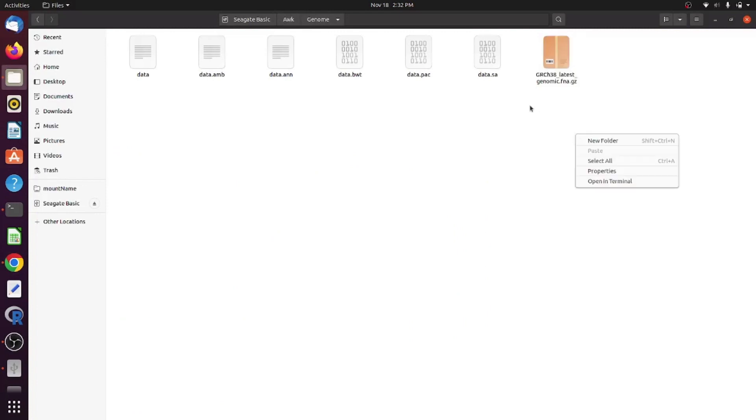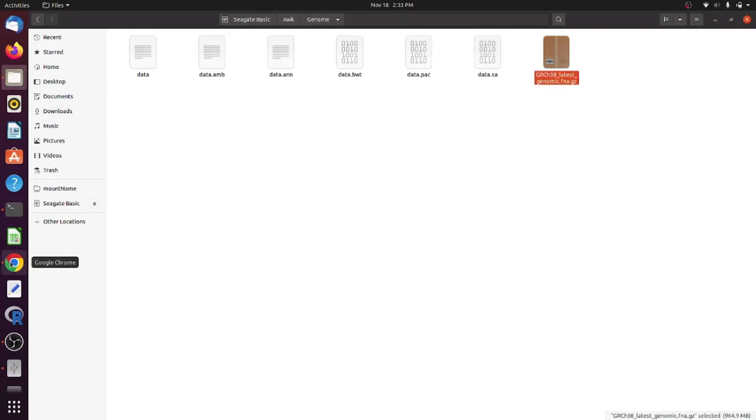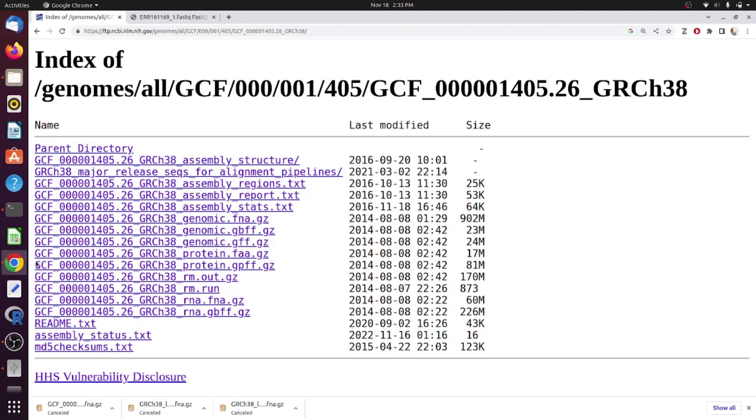The best way is to have a specific directory for your reference genome files as later you will have annotation and indexed files for your reference genome. Just like I have shown here.